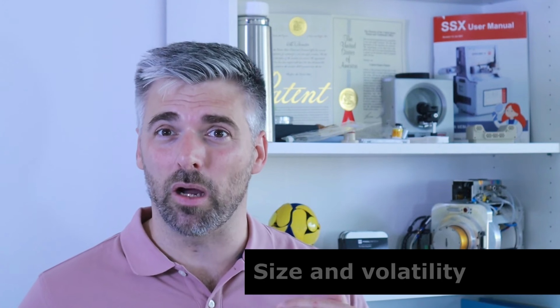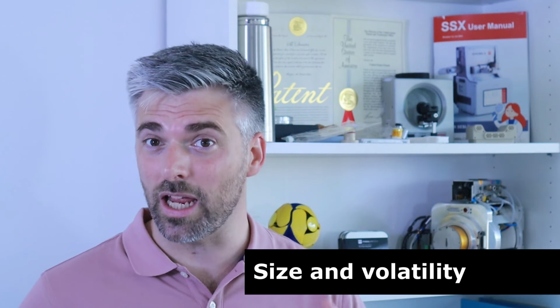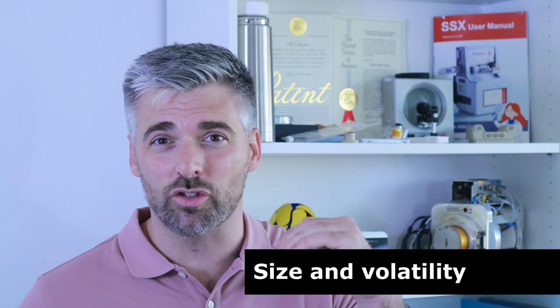First, why are larger molecules so difficult to detect? There is a strong correlation between a molecule size and its volatility. Molecules in the liquid are constantly bumping and pulling into each other. To escape into the gas phase, a molecule in the surface of the liquid needs to be kicked hard enough to break free from the pull of its neighbors. Larger molecules are in contact with more neighboring molecules, so it's harder for them to escape. And it's easier to fall back. They recondensate, either forming aerosol or sticking to the walls of the instruments.